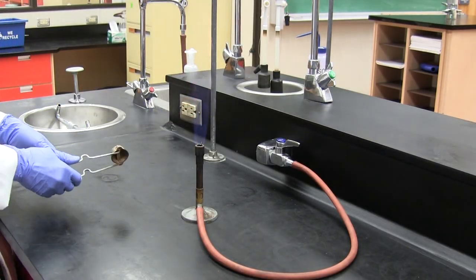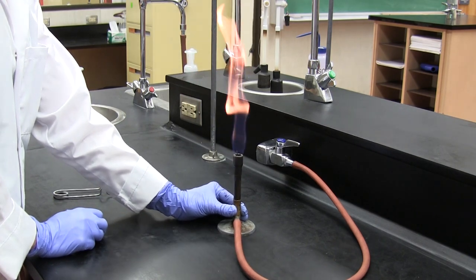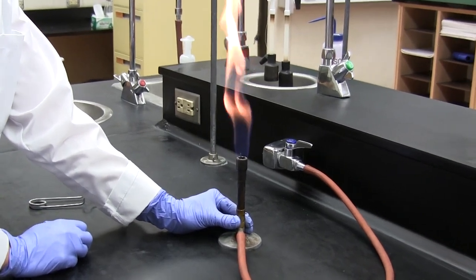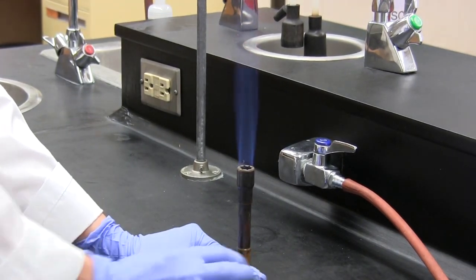So that completes our quick look at the Bunsen burner. Your instructor may want to point out some additional features and provide more information on heating with the Bunsen as it applies to any specific experiment which calls for its use.